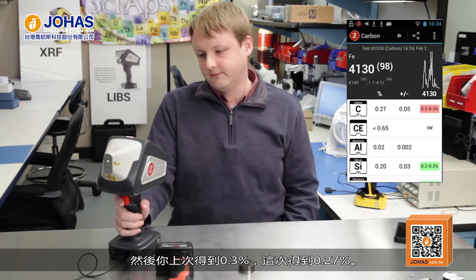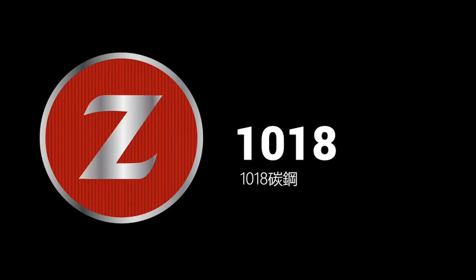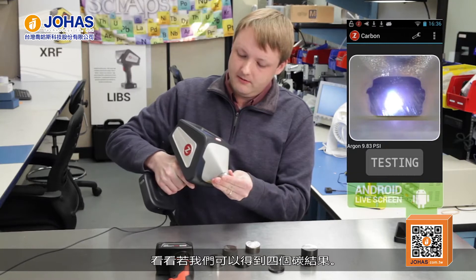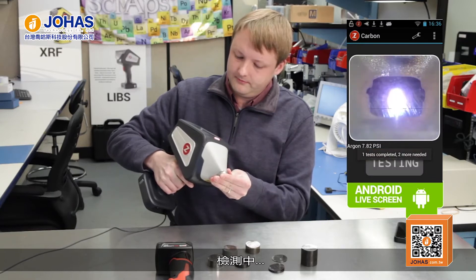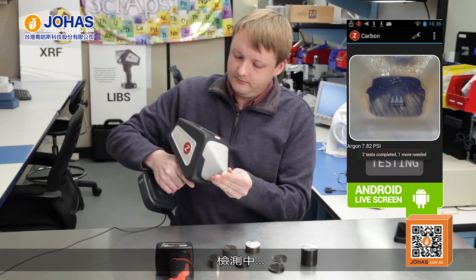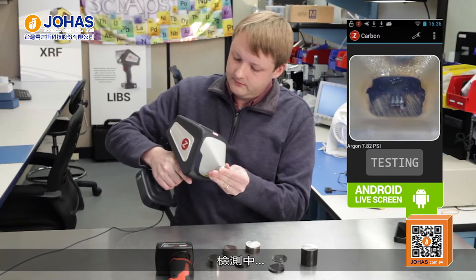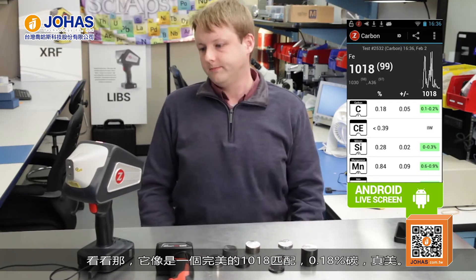We got 0.26 last time and 0.27 this time — that's even better. Now I have a 1018 that has 0.17% carbon in it, so we'll shoot this a few times and see what we get for a carbon result. It's like a perfect match — the analyzer is reporting 0.18% carbon for the 1018. Beautiful.